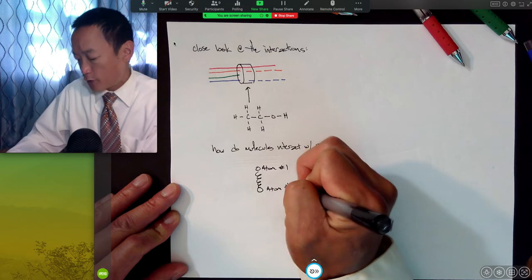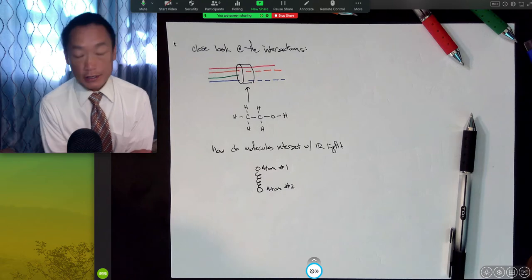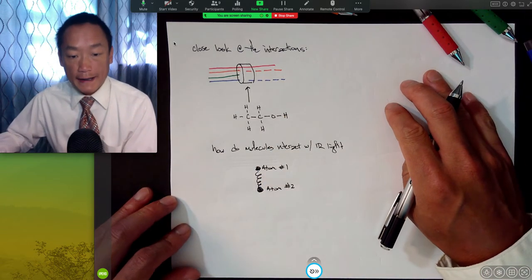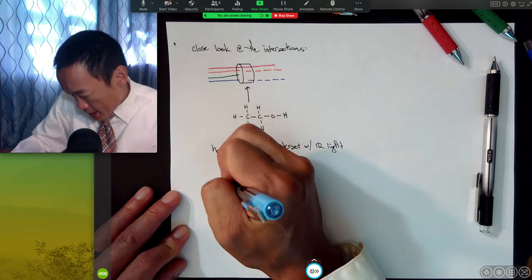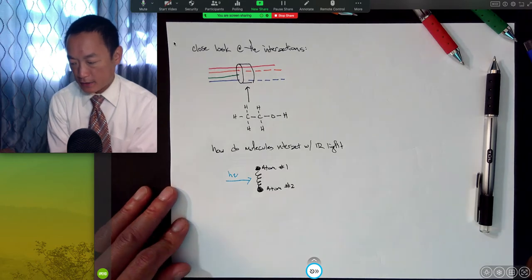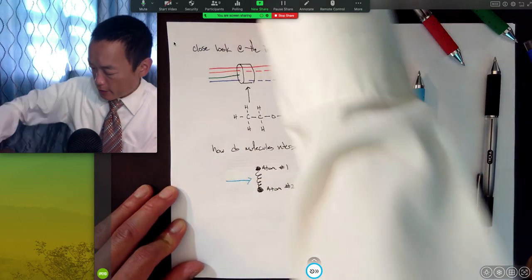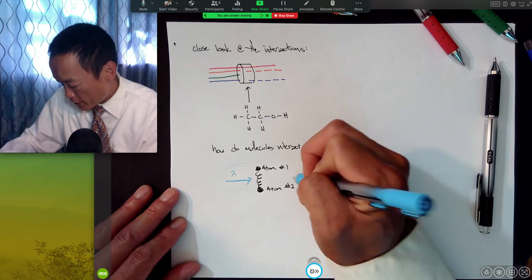If you were to look at a very classical and simple definition of a bond, you would be looking at the idea of having two atoms that are separated by a spring. And the idea is that when a wavelength of light hits that, when that wavelength of light hits this molecule, it could cause this bond to vibrate.